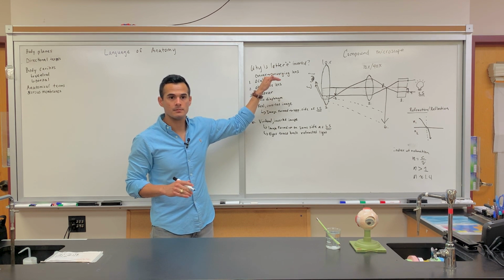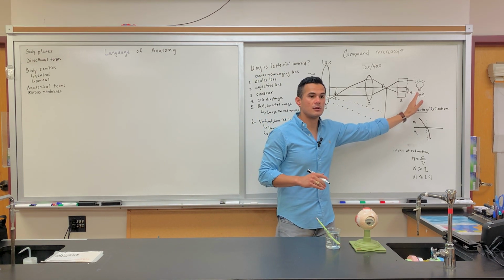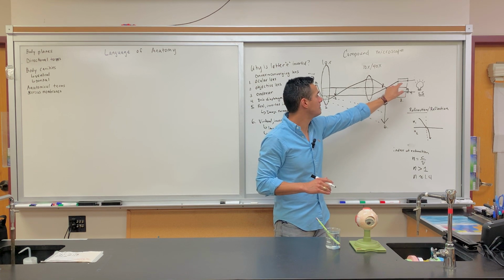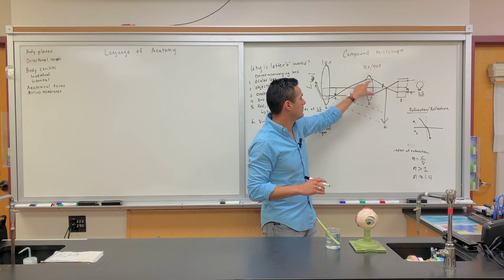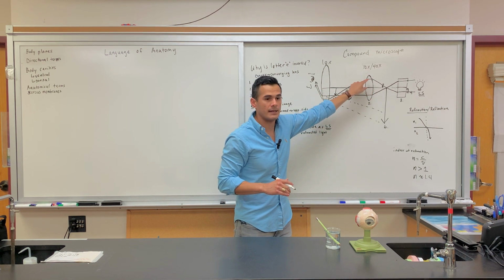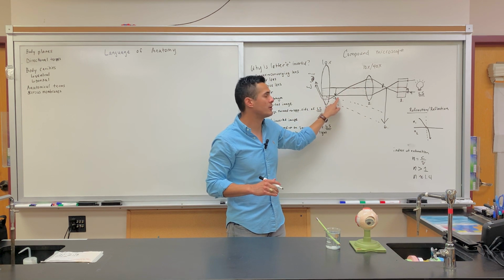No. So once again, what happens? The light source, the parallel rays will travel through the condenser. They will converge. They converge here. They get on the objective lens. Once they get to the objective lens, refraction happens. They converge at this point. They form the real image.